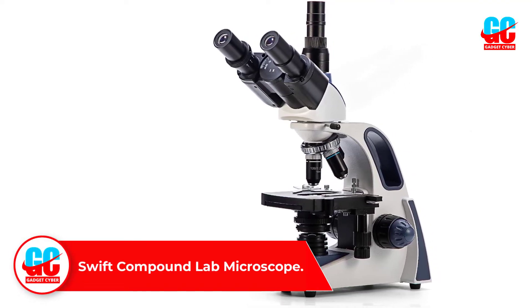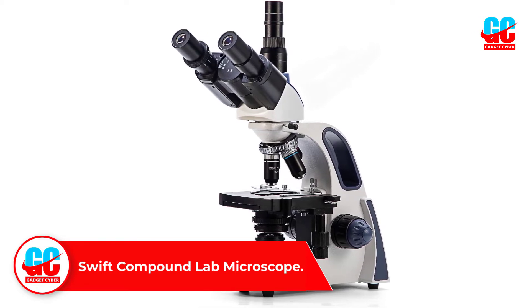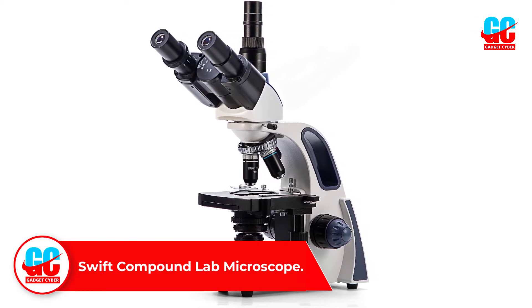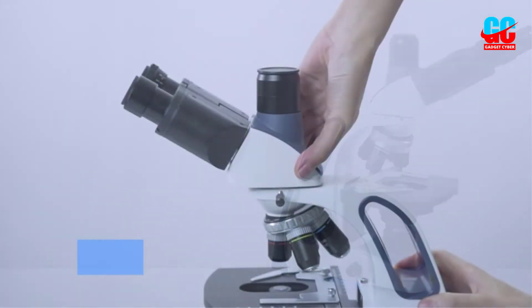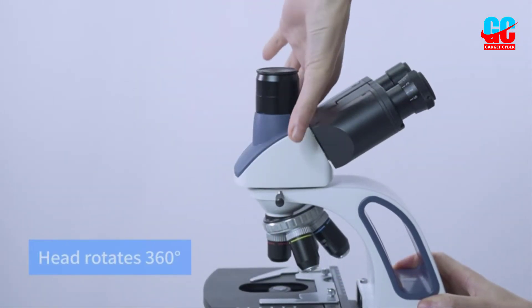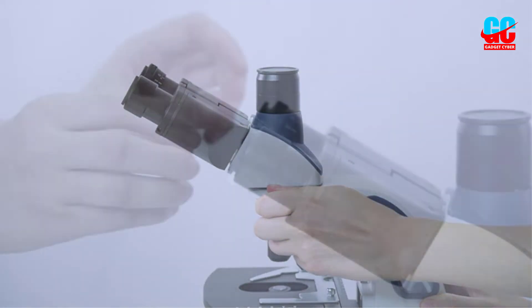Number 2: Swift Compound Lab Microscope. You can tell as soon as you lay eyes on the Swift SW380T Trinocular Compound Lab Microscope that it's an impressive beast. Once you use it, you'll see that the performance lives up to and even exceeds expectations in every facet.